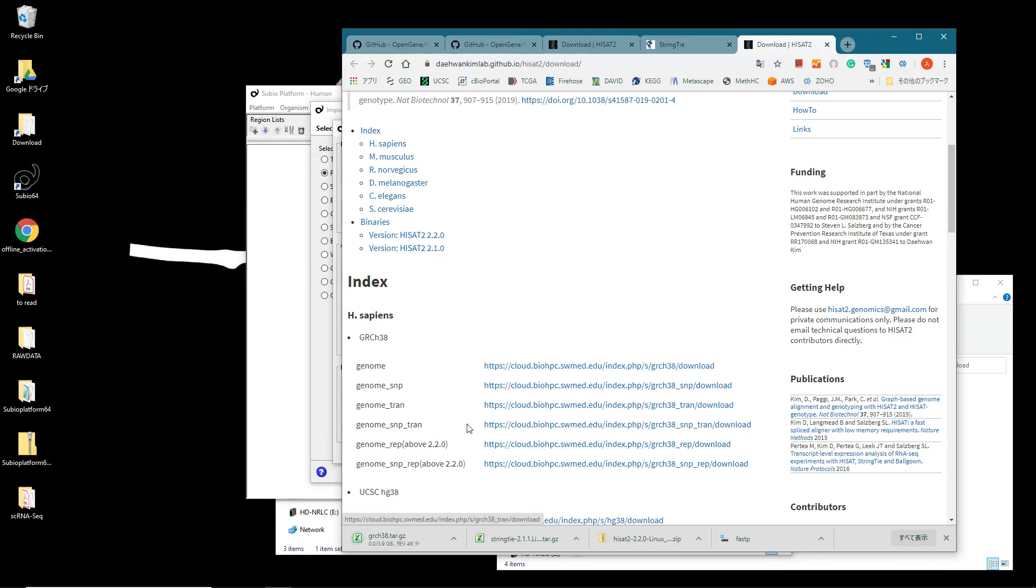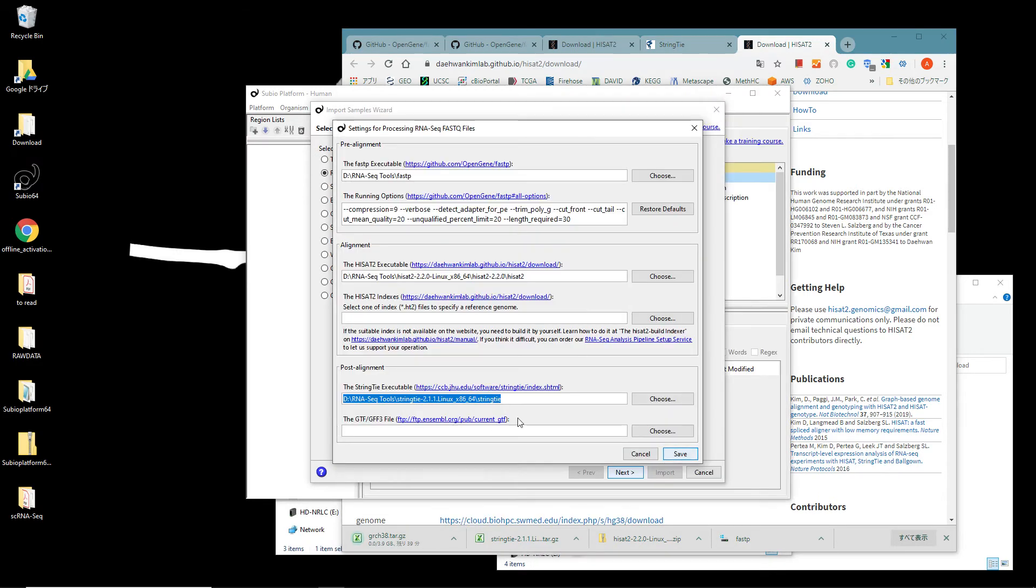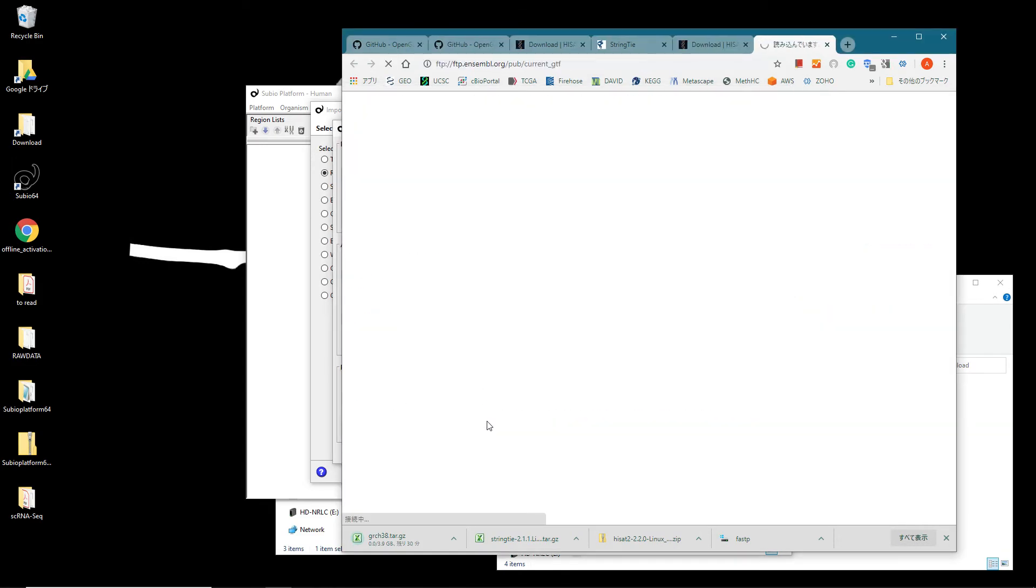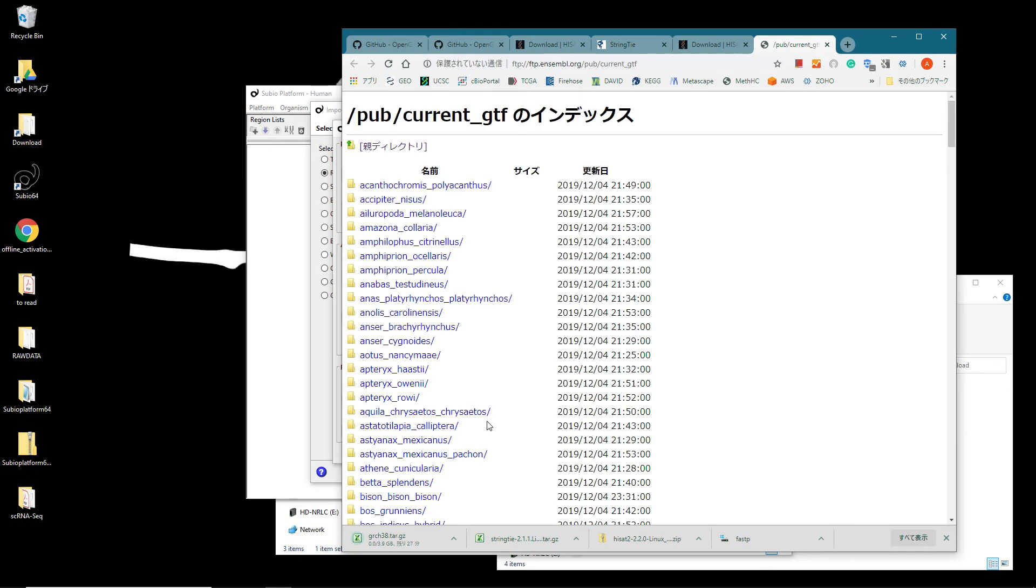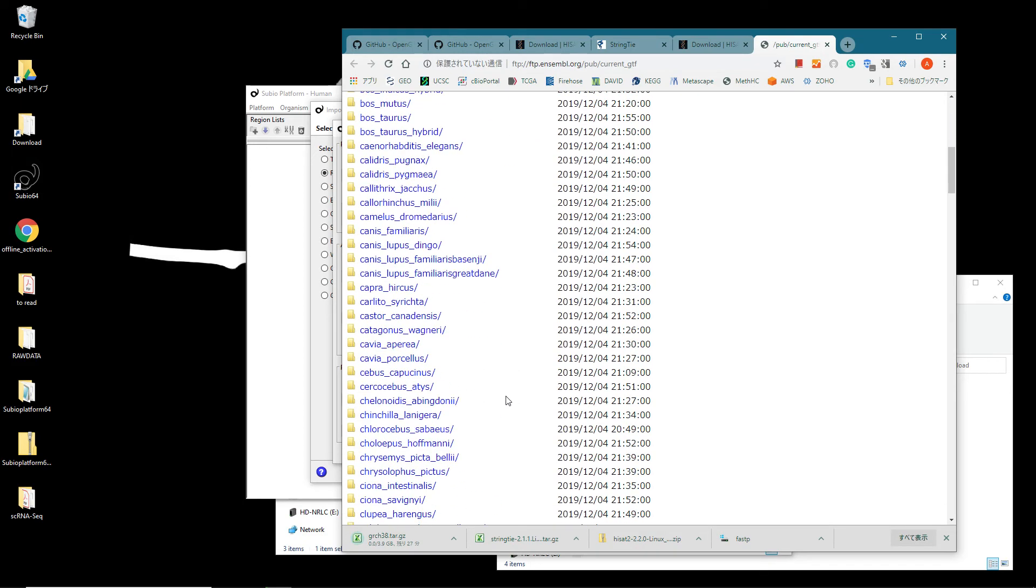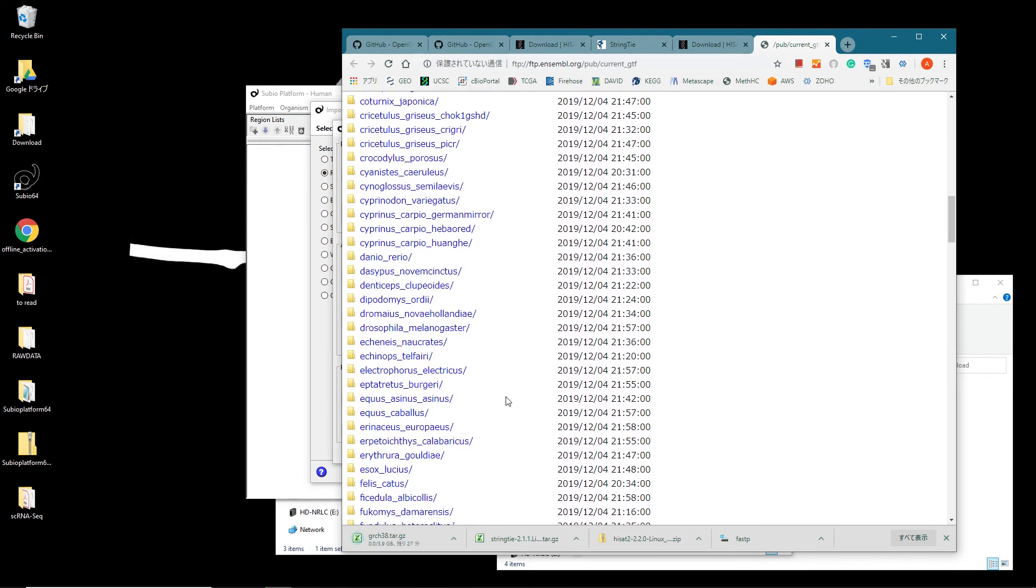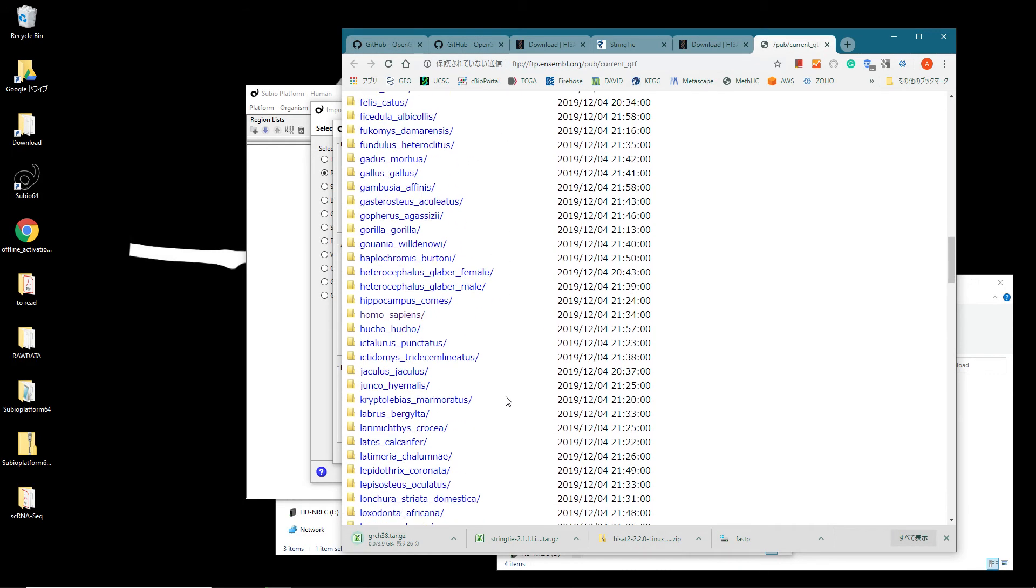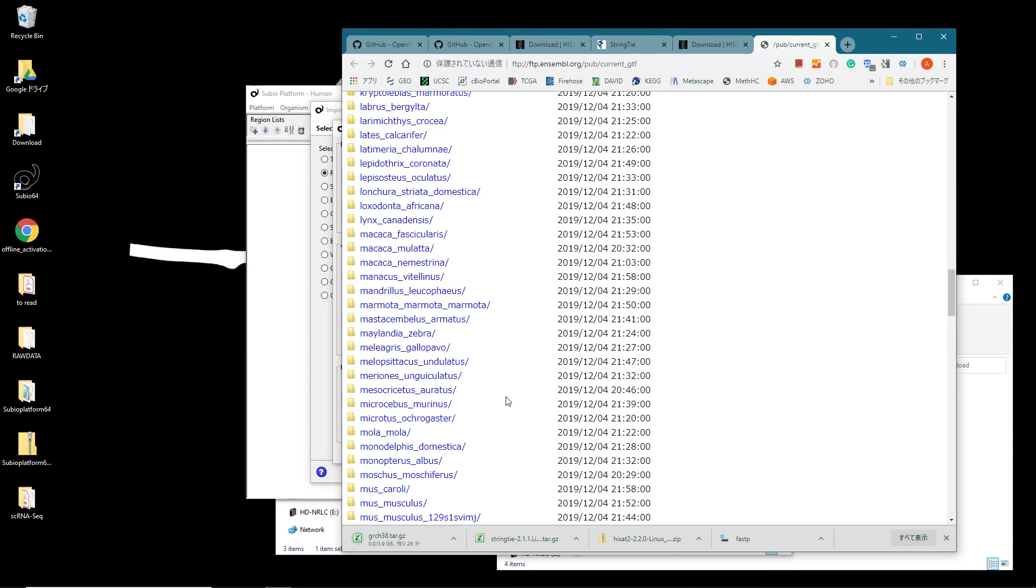Go back to the Subio Platform's setting panel and click the link at the GTF GFF3 file section. Find the HOMO-SAPIENS folder and open it.